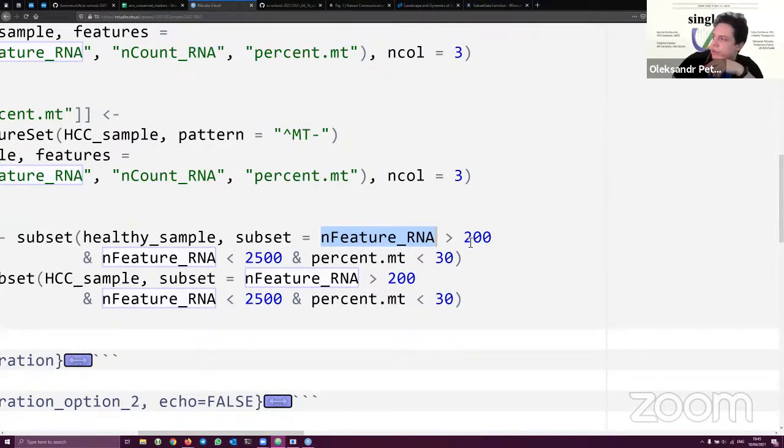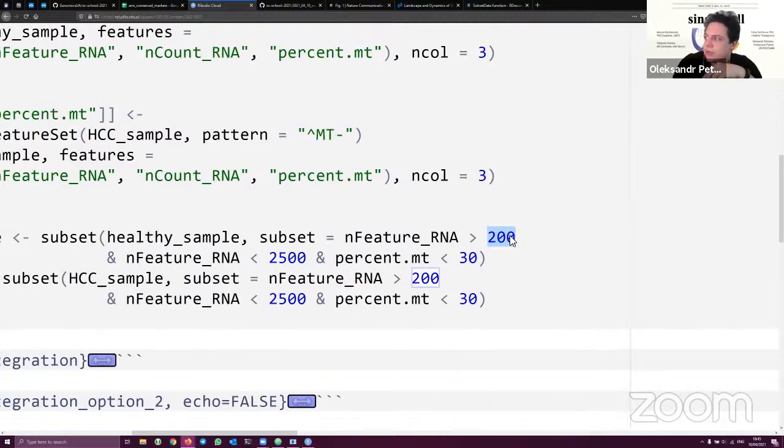And why do we filter for cells containing more than 200 genes detected? Because we assume that the cells which contain less than 200 either weren't sequenced properly, or maybe were dying, or maybe the gem bubble which is used for sequencing contains just remains of the cell after cell death. However, it's totally arbitrary, and it may be different for your specific analysis. So you can either use standard values provided by the manual, or just play around and find the best solution for your data set.